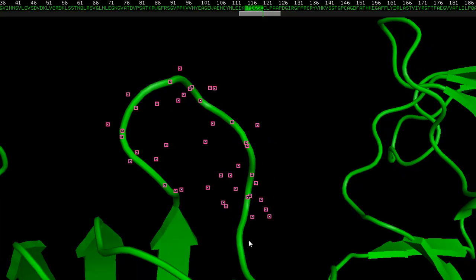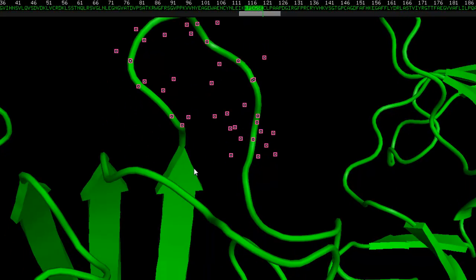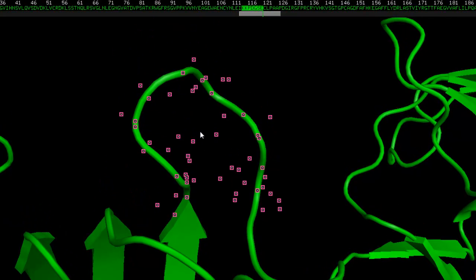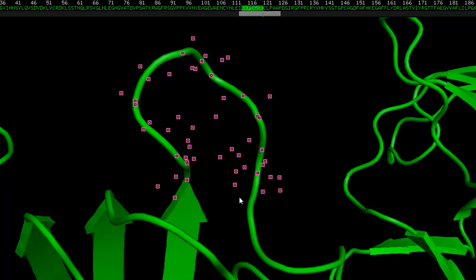So this looks good. We selected several residues, starting from lysine. Is there another lysine over here? Yes there is. So we'll do lysine, lysine, proline, D is aspartic acid, then we have glycine, serine, and glutamic acid.